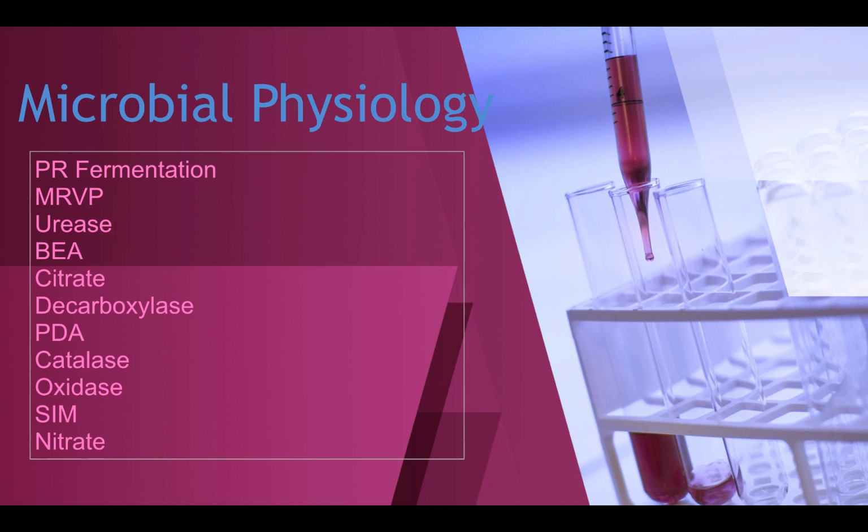Hello scholars, today we are going to complete our series on microbial physiology. In the first video we talked about PR fermentation and MRVP. In the second video we discussed the urease test, BEA, citrate, decarboxylase, and PDA. Today we are going to end with the catalase test, oxidase test, the SIM, and nitrate.